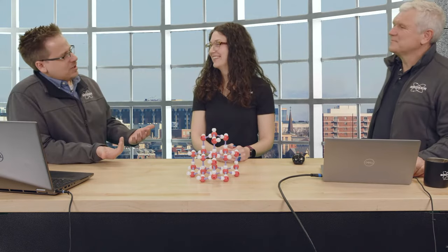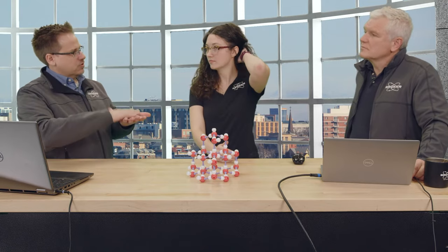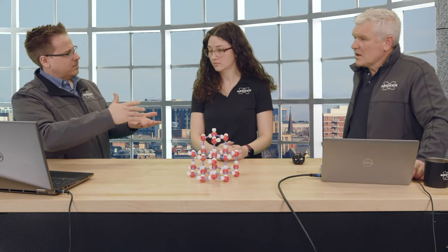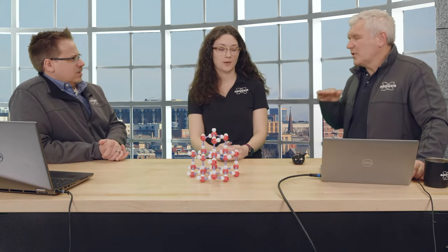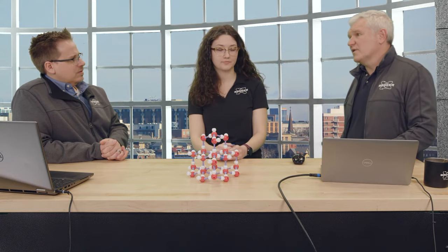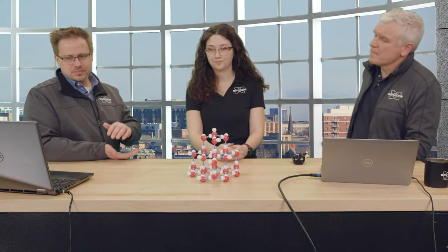So, when I hear composites, I'm a materials engineer, I think more about layered structures where I'm going to add carbon fiber and then another layer and another layer. Is this what's happening also in composites on an atomic level? You're talking more about two dimensions. Then think about the same thing in three dimensions. You basically have two materials that are different and they're interpenetrating and then they mess with each other. And then the messing with each other will cause satellite reflections too. So it's kind of that atomic-level layered structure of multiple materials.